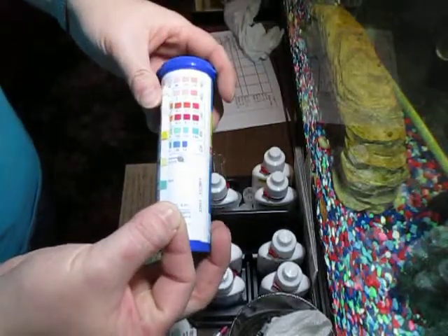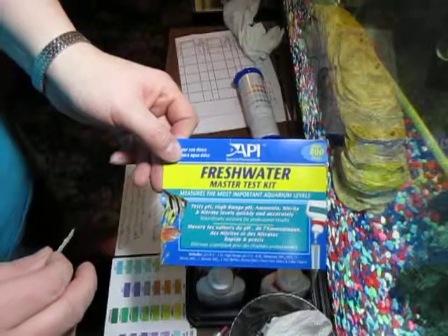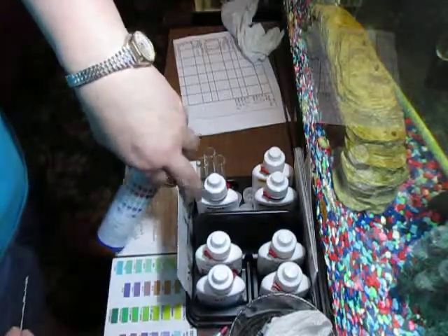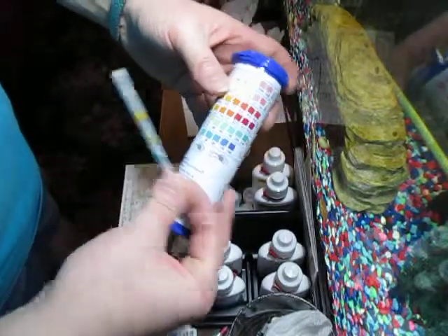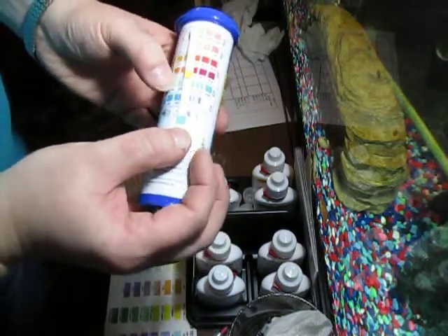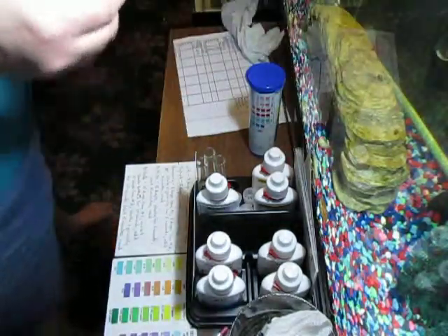There's your color chart right there on the back. I love these things. I do have the API Freshwater Master Kit, which I did use at one point in time to compare with this. There are a few quirks to the strips. For example, when you're reading the pH, you want to read the center most color — not the edges. The center most color is your most accurate reading. Now I have a nice fluorescent light here for good viewing.